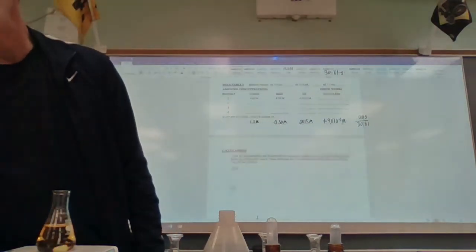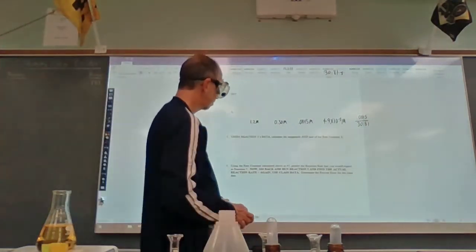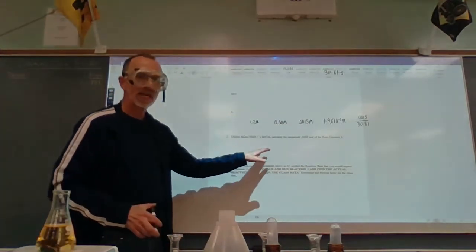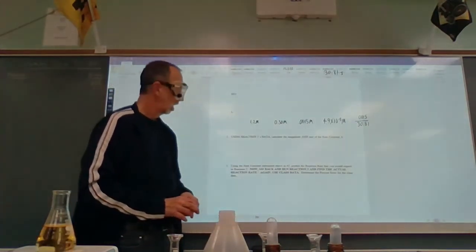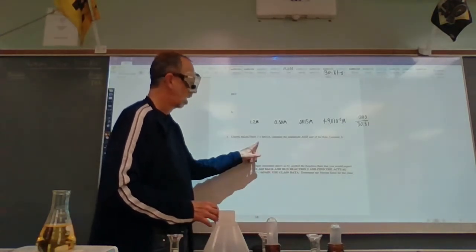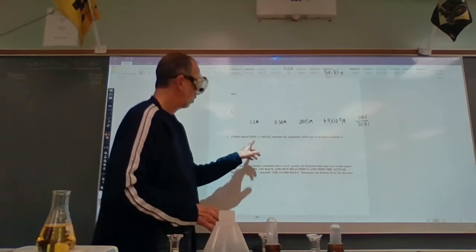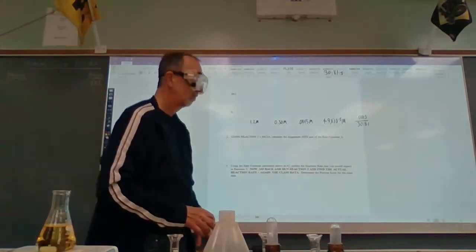So as we go back to the calculations, and I'm going to let you finish these on your own. Remember, we calculated the theoretical rate from the data we have in reaction 5. We have our rate law. We have our value of K that we determined here.